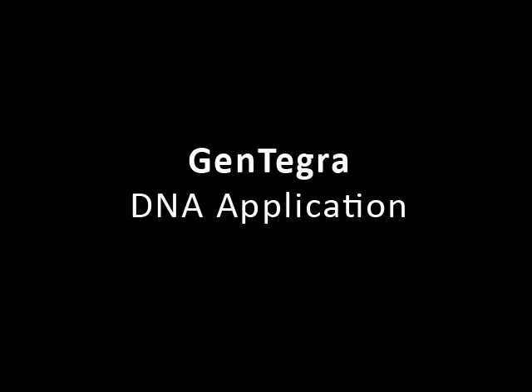In this module, we will demonstrate how to apply DNA to Gentegra DNA tubes.